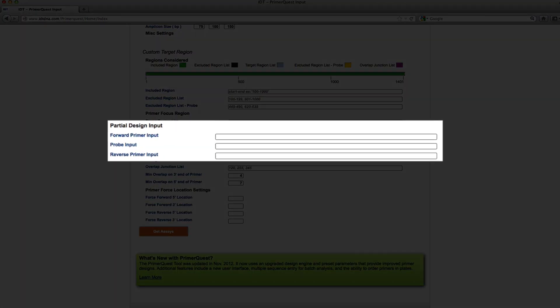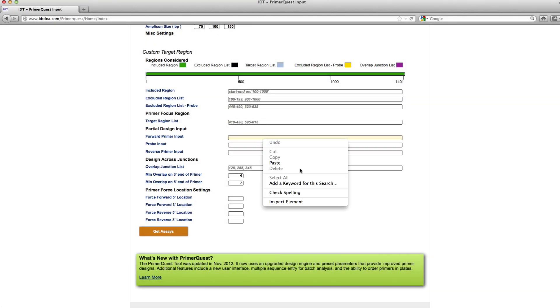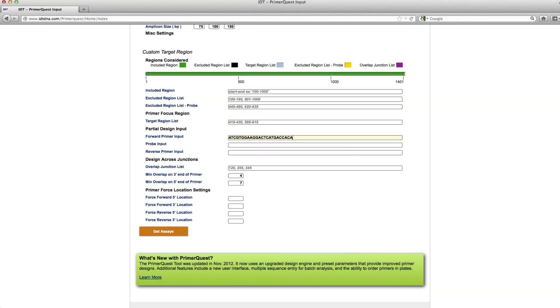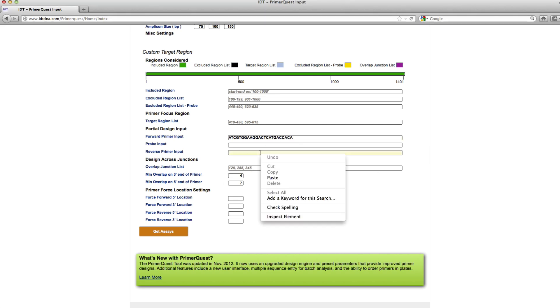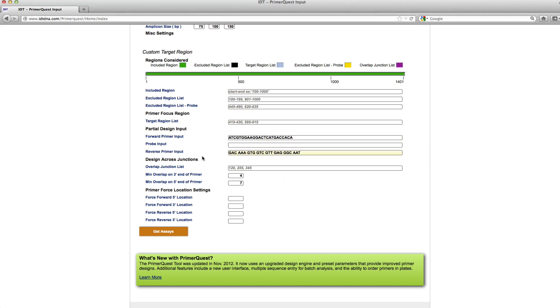In this partial design input section, that is the section that I'm going to put the forward and reverse primer sequences in. I'm going to go ahead and paste those in here, and then once I have those both pasted in, since I only have one option left which is the probe sequence, that's what the tool will design for.